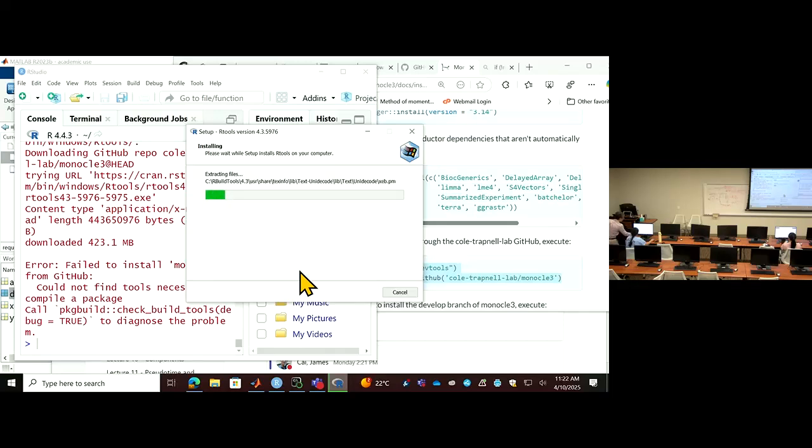Do you have the window pop up for this? I don't. It should be this. This one? Yeah, you just select maybe. I don't know what this is. Yeah, maybe just say yes. So this will do the same thing over there. So yeah, it takes some time.